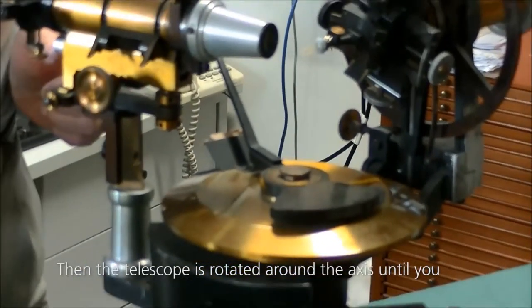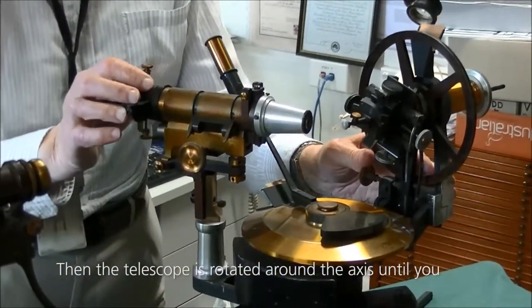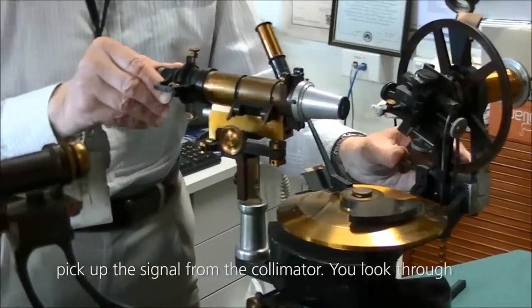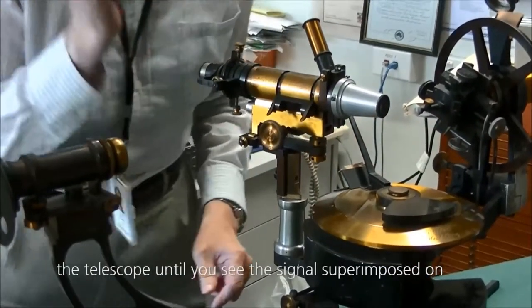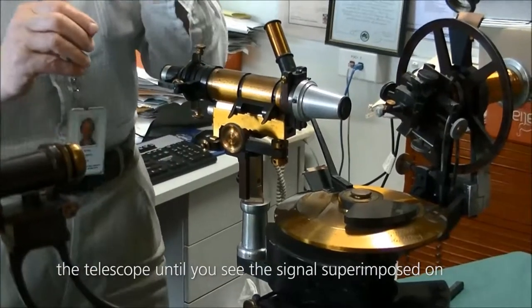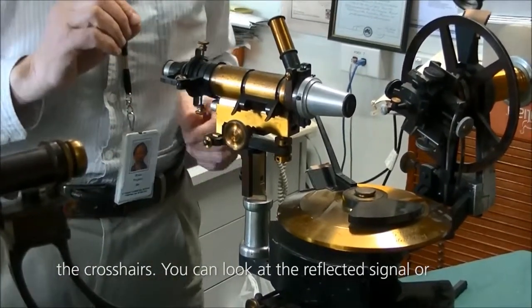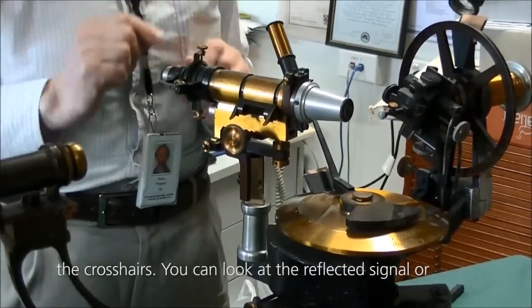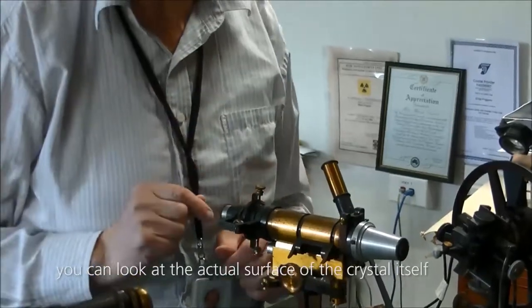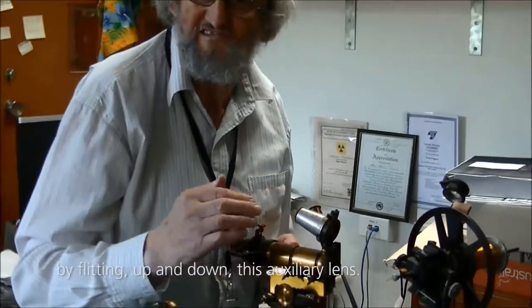Then the telescope is rotated around the axis until you pick up the signal from the collimator. You look through the telescope until you see the signal superimposed on the crosshairs. You can look at the reflected signal or you can look at the actual surface of the crystal itself by flipping up and down this auxiliary lens.